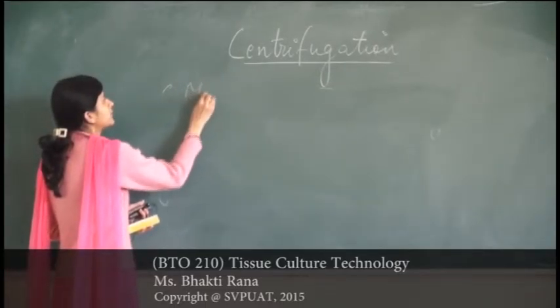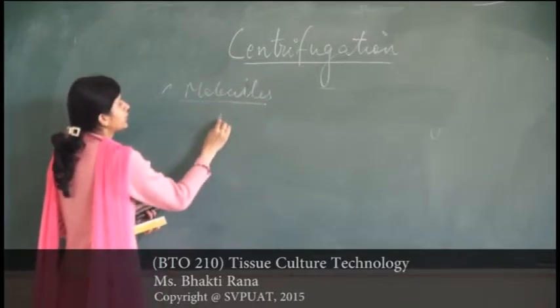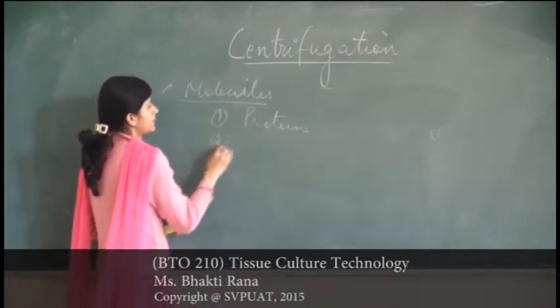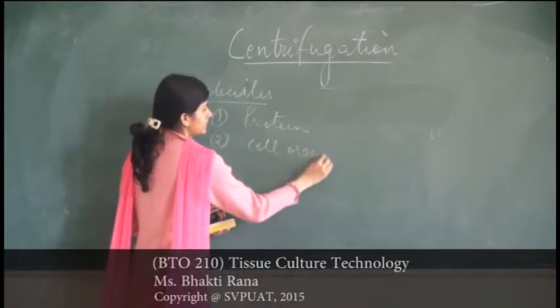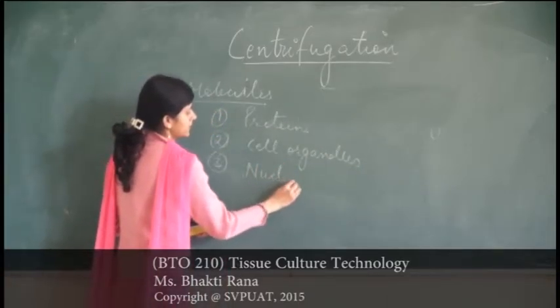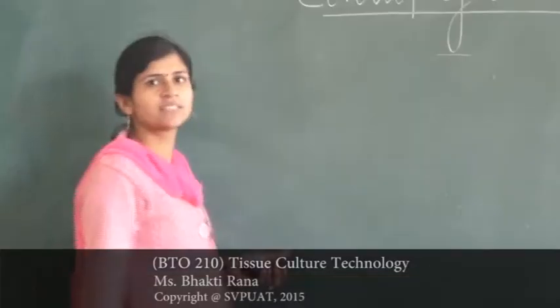Next, which molecules are separated on the basis of centrifugation? The molecules separated are proteins, cell organelles, then you have nucleic acids, which are separated on the basis of centrifugation.